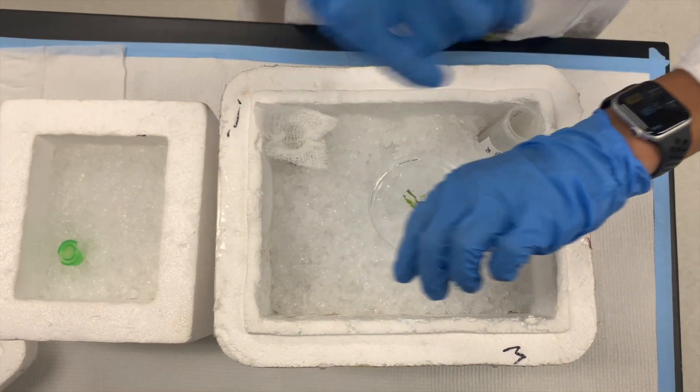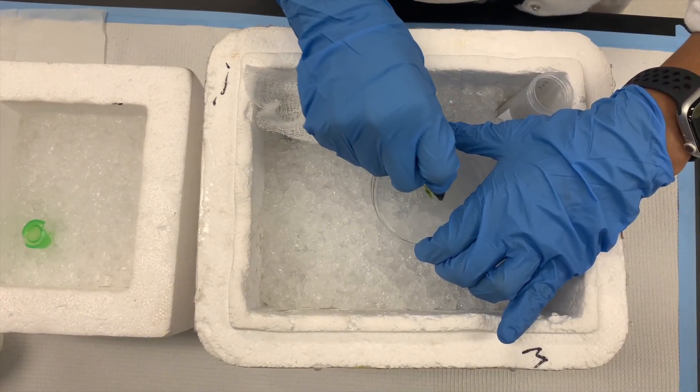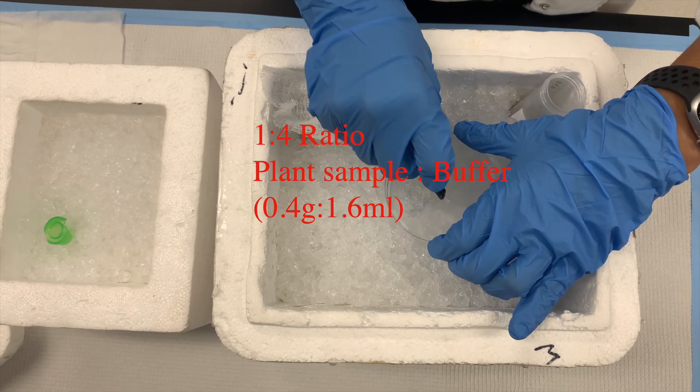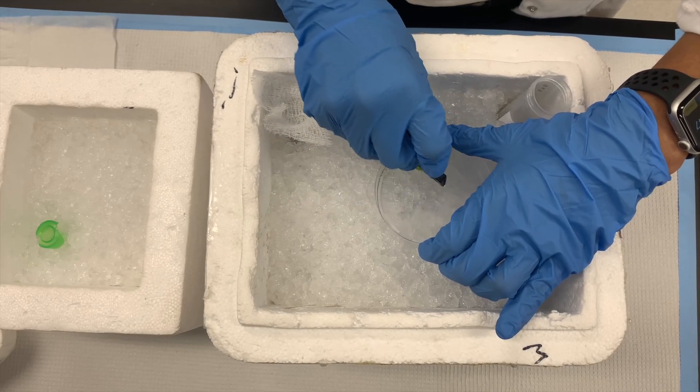We will chop for one minute. Any more time and the nuclei may be damaged according to Galbraith. We will be using a 1-to-4 ratio of plant material to Galbraith's buffer. This gives us the best results.